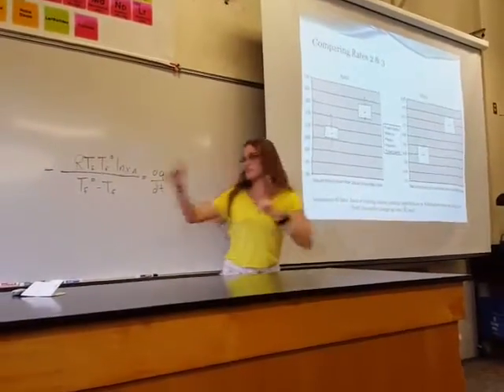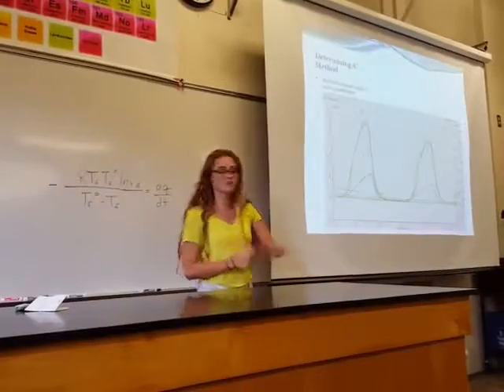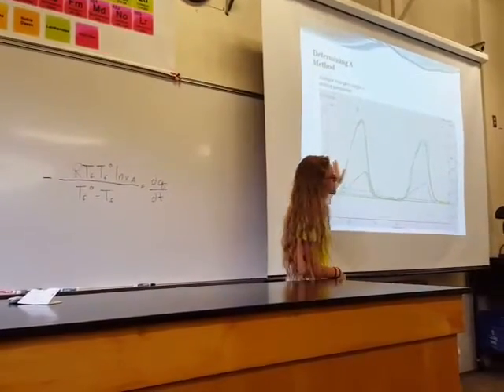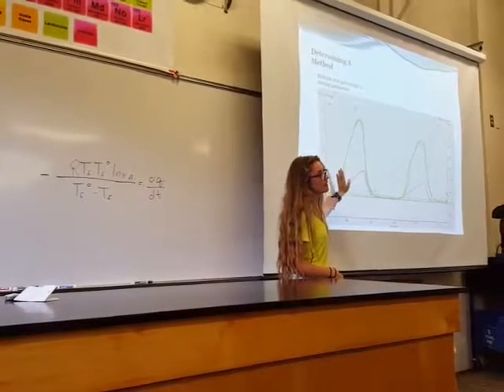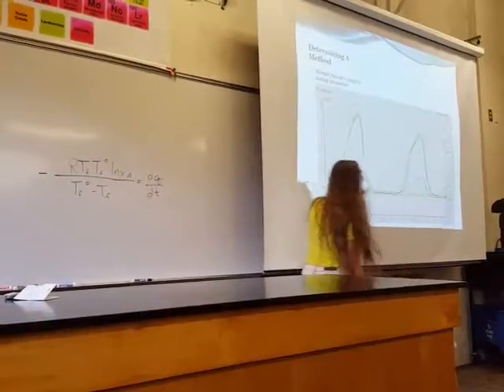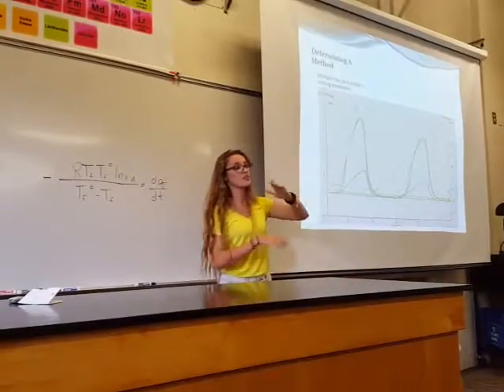And that is shown in the next graph here. Because of this variance in the incline of the curves right here, as you can see right here and right here, as opposed to the 20 microliter, this is what we thought was happening.